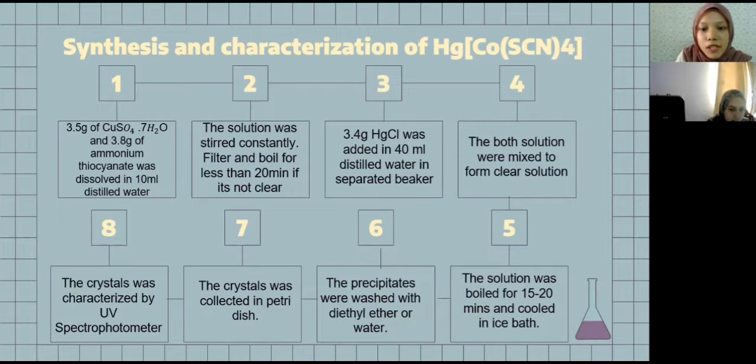And then the precipitates were washed with diethyl ether or water. And then the crystals were collected in a petri dish. And then the crystals were characterized by UV spectrophotometer.